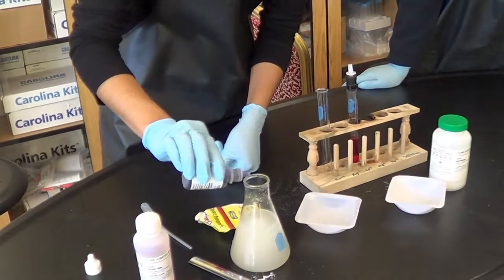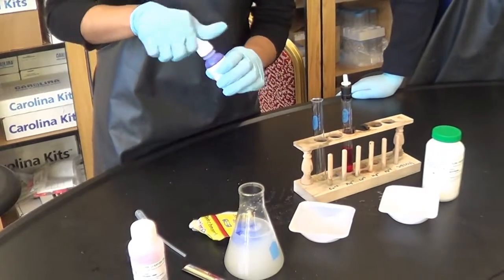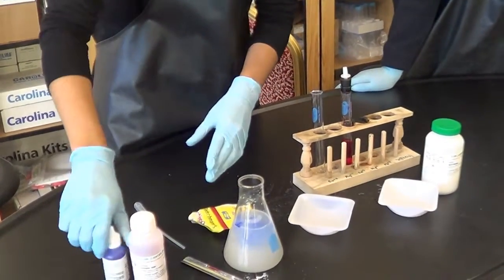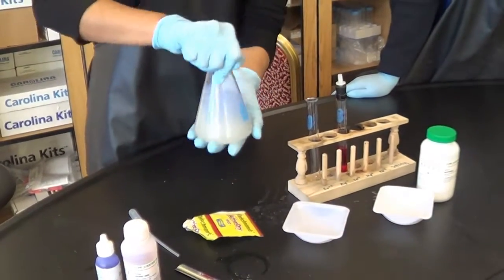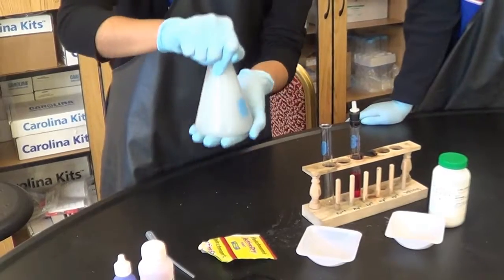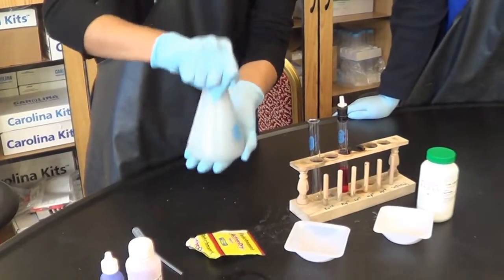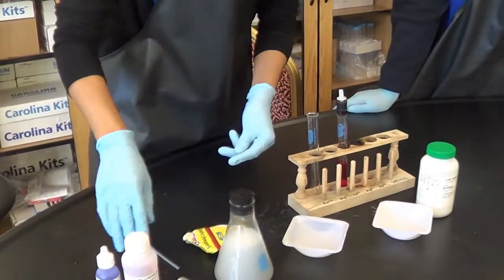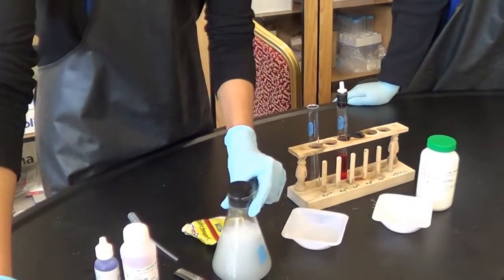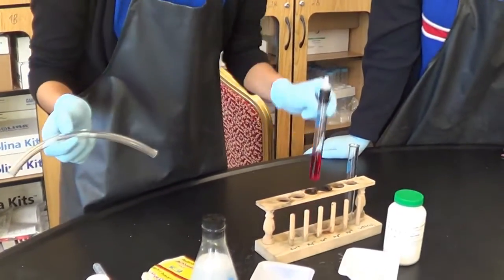phenol red solution. And these chemicals aren't toxic, but just for safety reasons and precaution, you just want to make sure you wear your goggles and your gloves. So then you just want to shake it. And then quickly after you've shaken that, you want to attach this tube to your red solution.